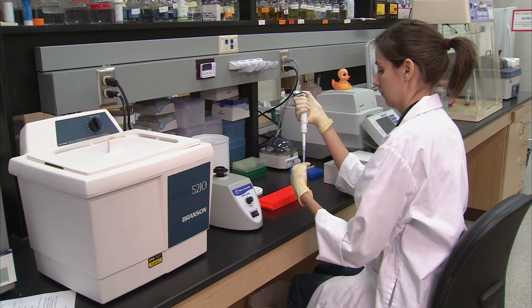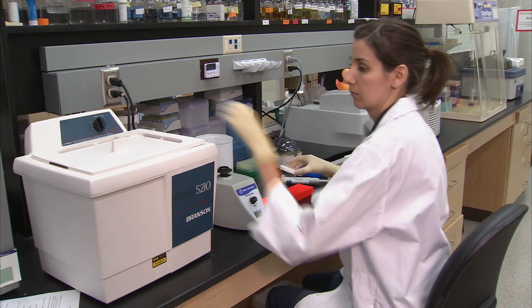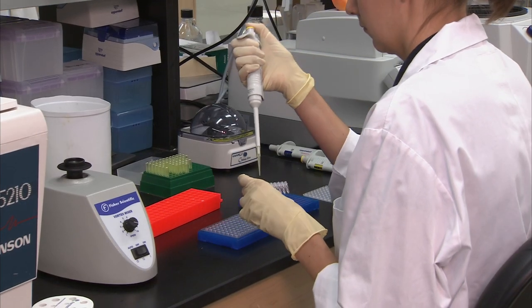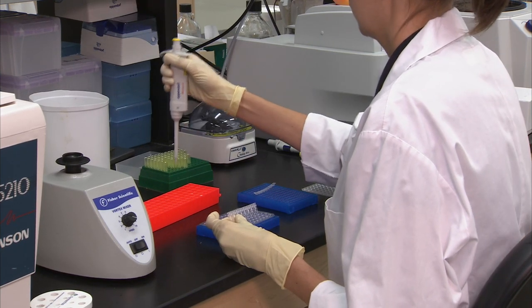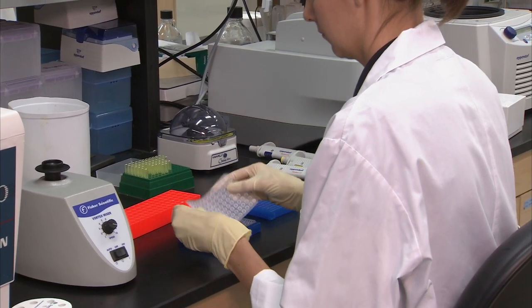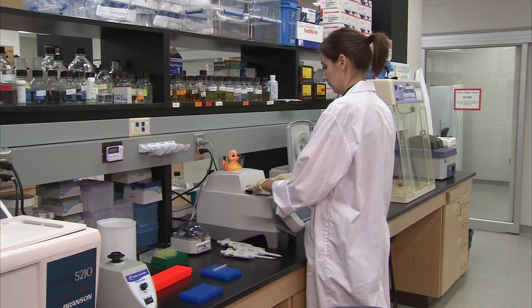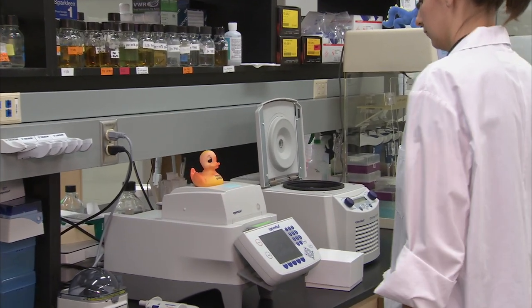Resuspend the microsphere master mix with a pipette and dispense an appropriate amount into an Eppendorf tube. Cap the tube and sonicate in a water bath sonicator for 2 minutes. Dispense 17 microliters of single-stranded PCR product into the appropriate wells of a low-profile 96-well plate. Add 33 microliters of resuspended sonicated bead mixture to each well. Cover the plate with a silicone cover and tap gently. Put the plate into the thermocycler with a program of 95 degrees for 5 minutes, 60 degrees for 10 minutes, 60 degree hold or pause, then 60 degrees for 5 minutes, and start the program.